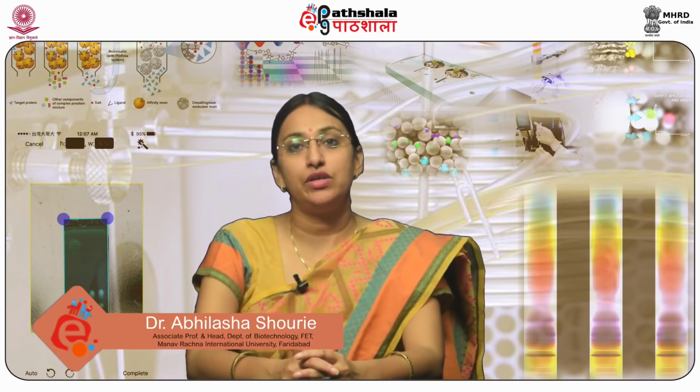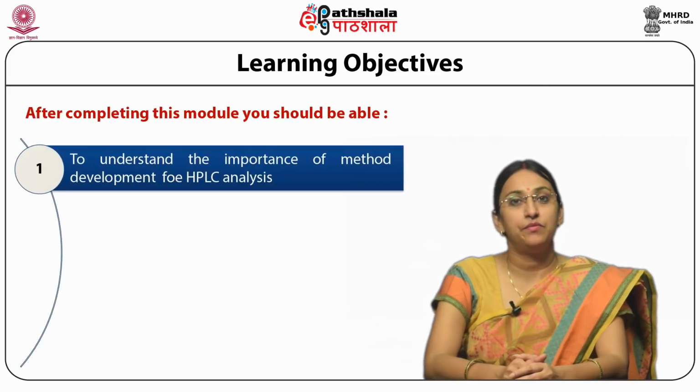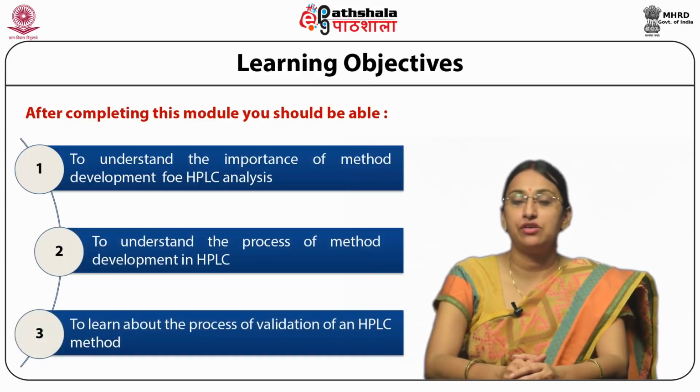Today we are going to talk on module HPLC method development and validation under the paper Chromatographic techniques. After completing this module, you should be able to understand the importance of method development for HPLC analysis, to understand the process of method development in HPLC, and to learn about the process of validation of an HPLC method.